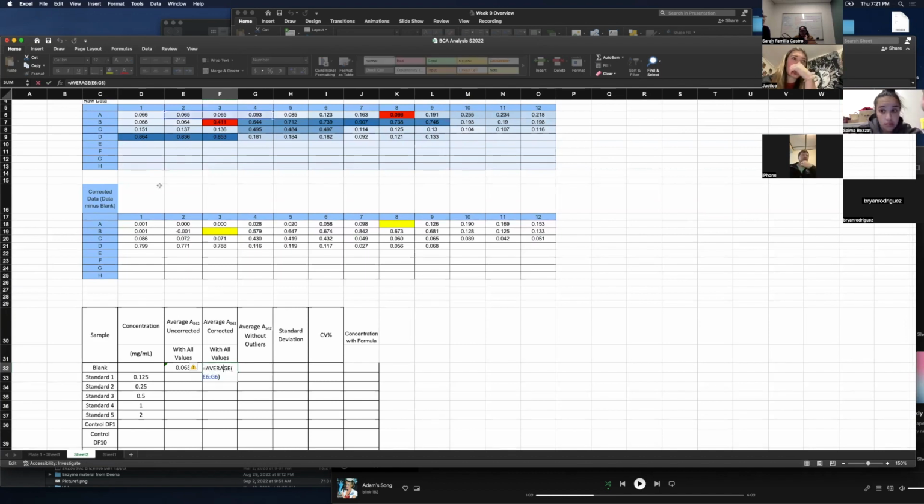If I double click this now, Excel has been like, okay, you want to average these 3 cells just to the right of the first 3 cells. That's what we avoided when I added those dollar symbols in the math before. The dollar symbols stop Excel from moving things 1 or 2 cells or 5 cells up, down, left, right, whatever. It locks it in place.